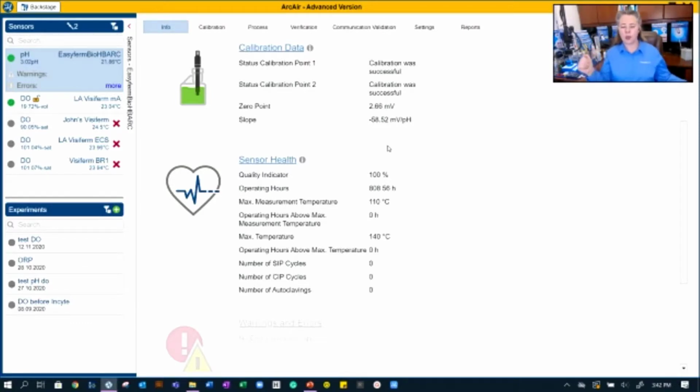So you calibrated it, it was good, you put it in the autoclave, it came out and something happened. You can actually put the sensor cap on and figure out what the problem is without removing it. Troubleshoot, figure out, is it a cable, is it a problem? Maybe you're getting a great signal out of the Bluetooth, but you're not getting any signal read into your bioreactor. It could just be that your cable died. And replacing a cable is a lot faster than replacing an entire sensor and throwing everything out.